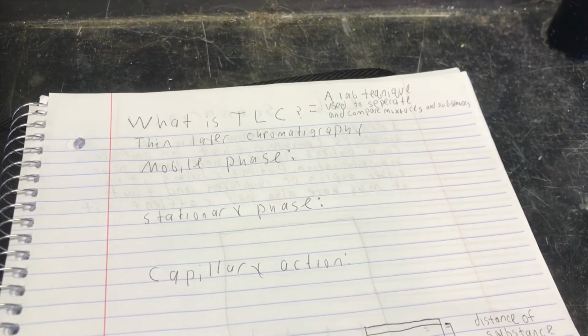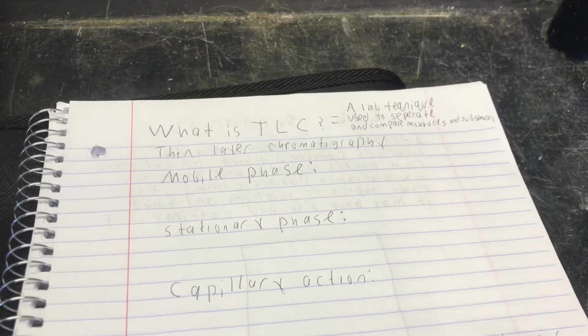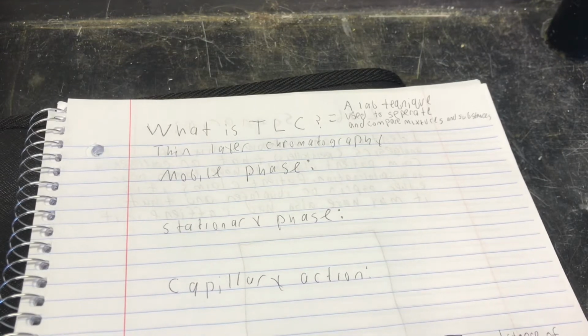Hi everyone, today I'm going to be giving a quick introduction to TLC. So you might be wondering, what is TLC? TLC stands for thin layer chromatography. We'll come back to that later.